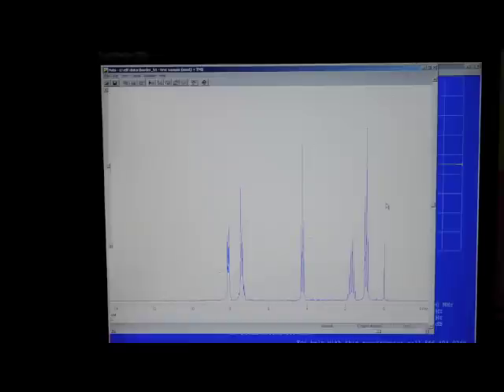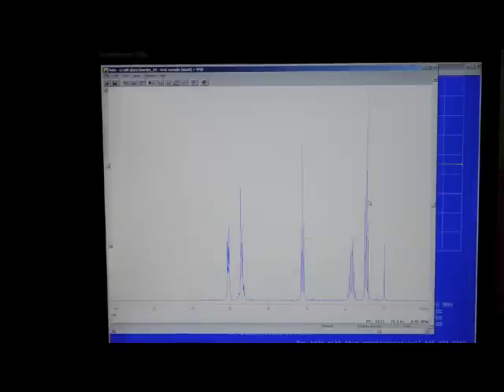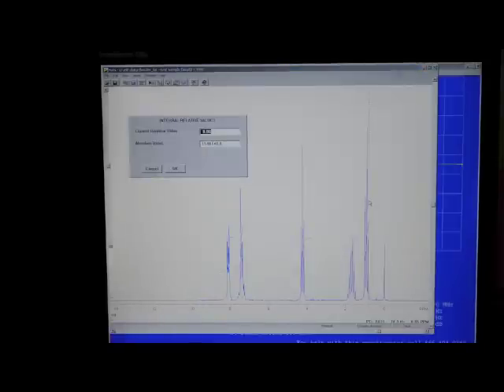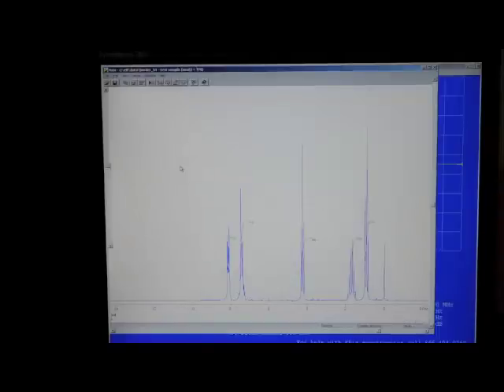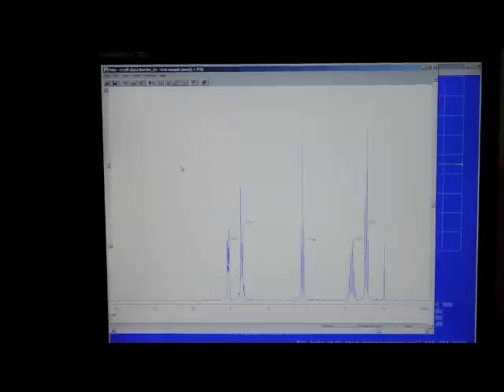To set the base value for the integrals, click once to get a cursor. Place, without clicking, the cursor on a peak that you can identify as corresponding to a specific number of protons. Type the letter V and then type the number of protons for that peak. Here, the peak is a methyl group, so I entered the number 3. Press ENTER to leave the integration routine.